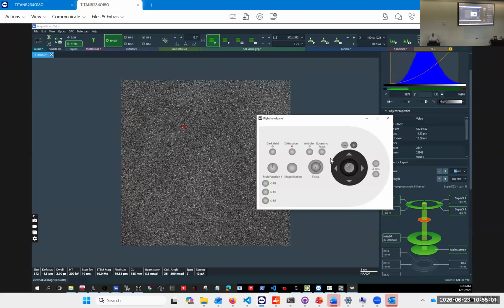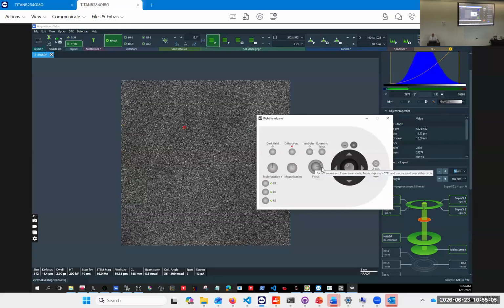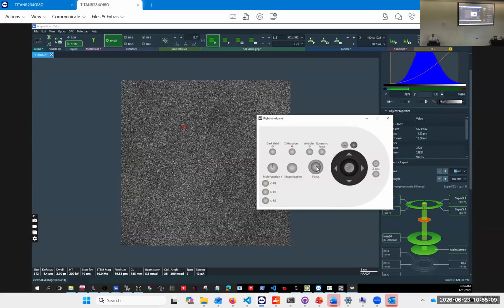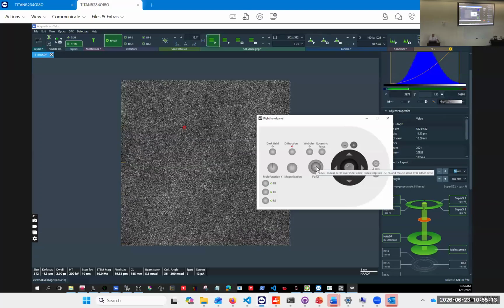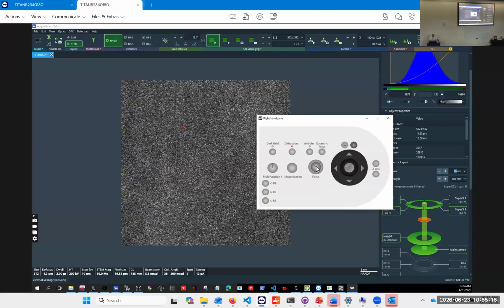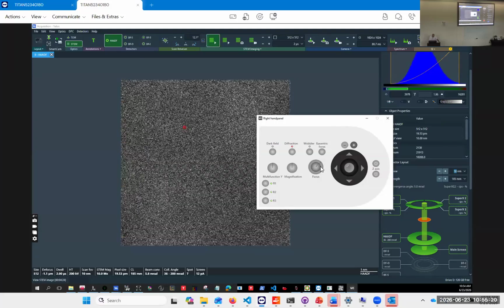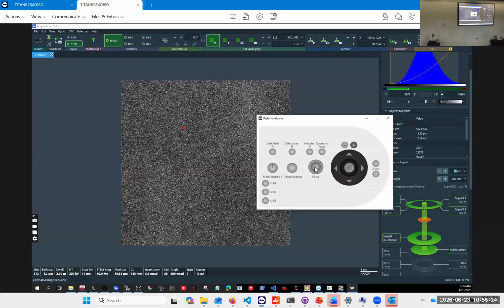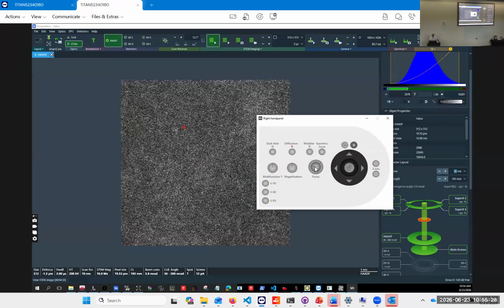You're getting into the break, but the point is that with lower convergence angles, your atomic resolution is at some point disappearing, and that is usually at the point when the disks no longer overlap. So here we come a little bit more, and then it goes. So we probably also have a lot of astigmatism. Once you do these things, you have to realign your microscope.